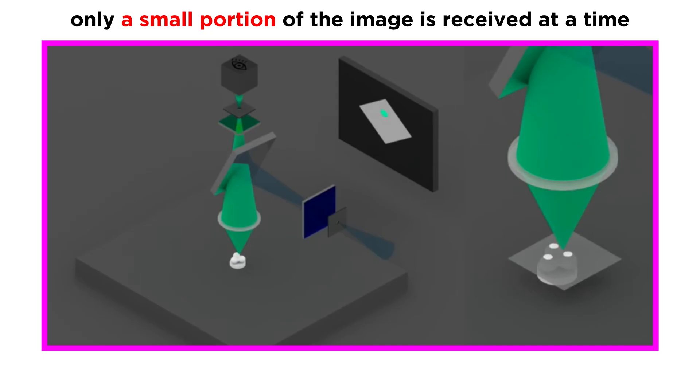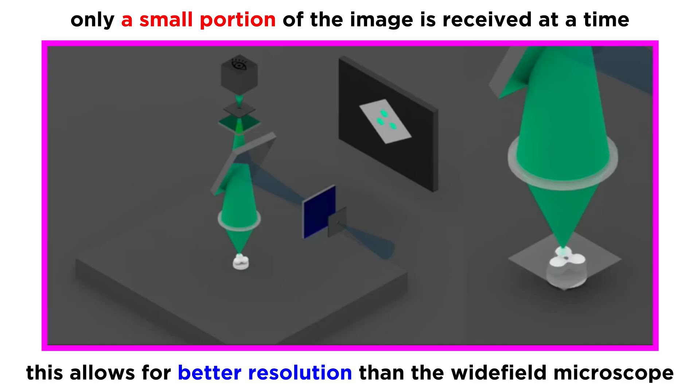Because of the function of the pinhole, the excitation photon scans across the sample, meaning that you only get a small part of the image at a time through the pinhole. This allows for better resolution compared to the wide field microscope, which allows scientists to look at thicker samples because of the low levels of background fluorescence.